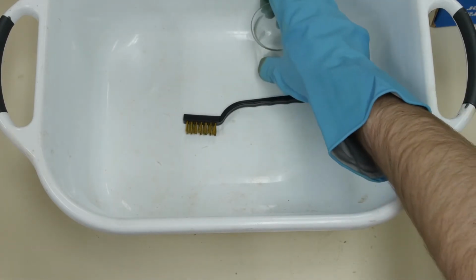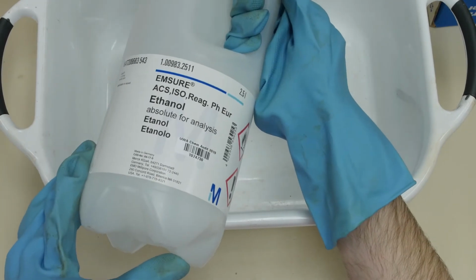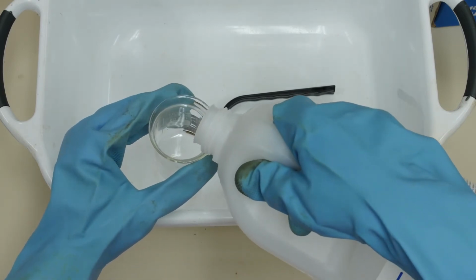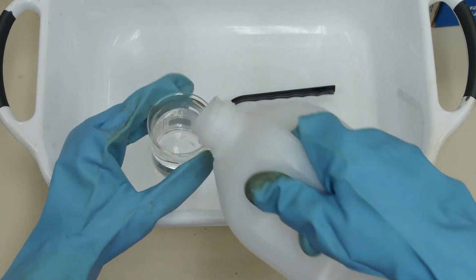Brass is softer than steel, so there is no chance of scraping away any of the metal from the coupon. The corrosion products are loosely attached to the mild steel, and the brush should be able to scrape them away. The water will help to wash away the corrosion products from the coupon after the brush has loosened them. Finally, the ethanol will speed up drying of the coupons.